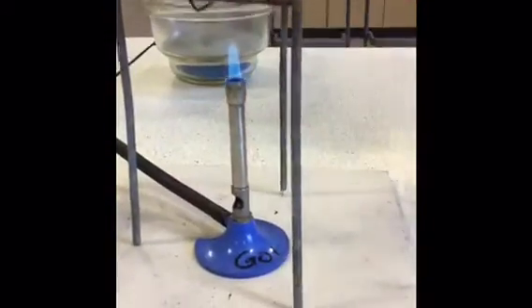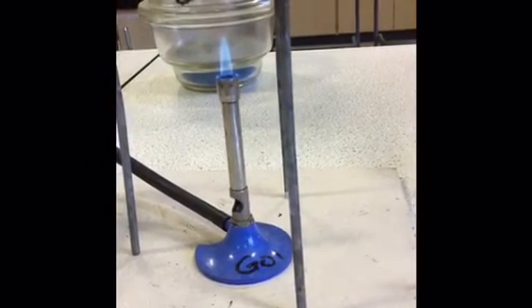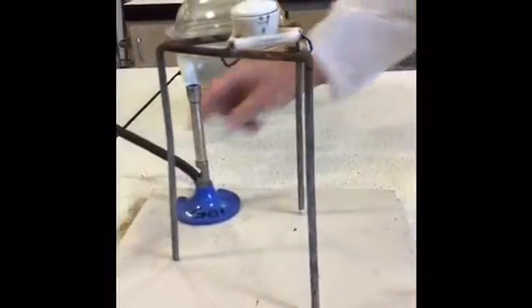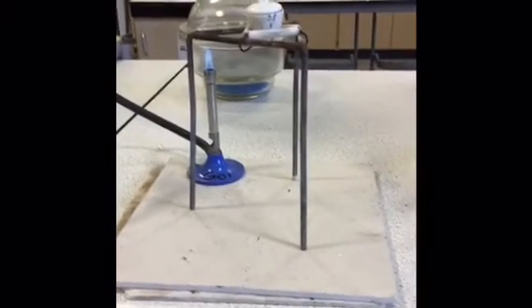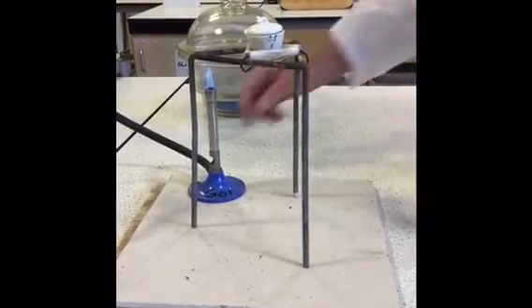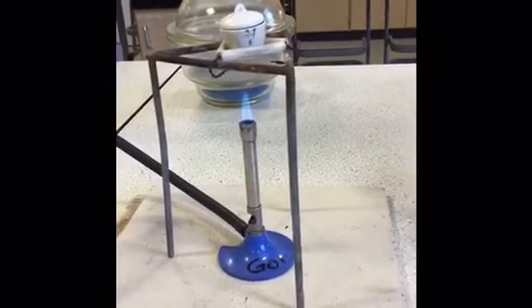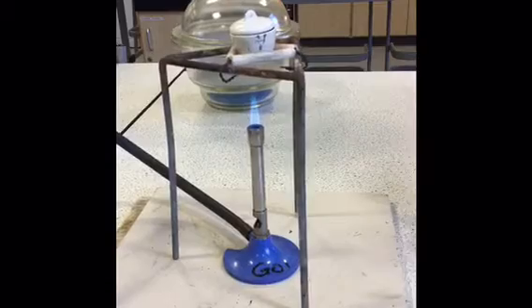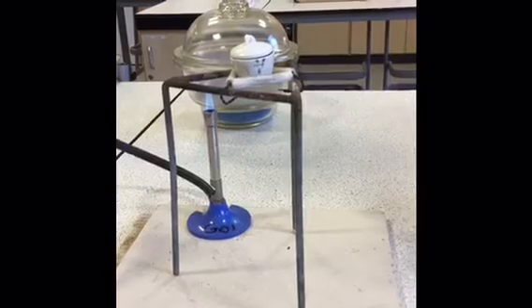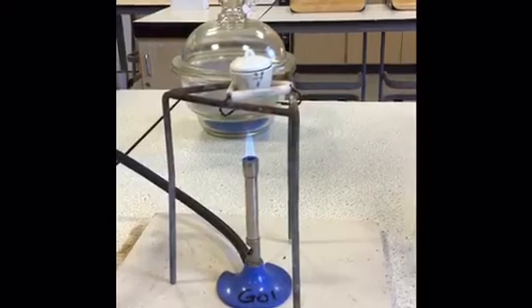But for the first couple of minutes, you alternate for about 15 seconds heating, and then after heating it for 15 seconds, remove the heat source for about 15 seconds. This is just for the very initial heating because this is when most of the water will be driven off. Okay, so heat again for 15 seconds. And then off for 15 seconds. Then after doing that for about 2 minutes, just leave the Bunsen under for about 10 minutes.